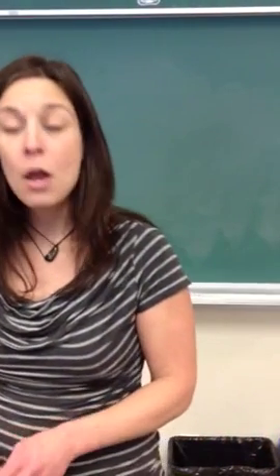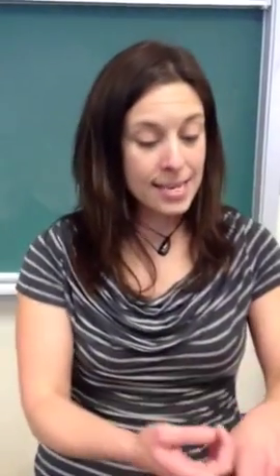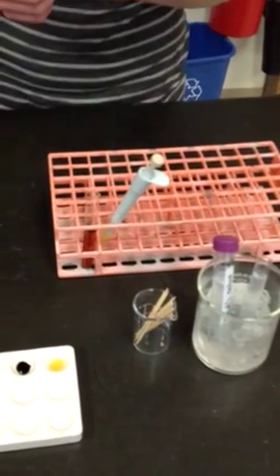Now, I will not put starch in there because if I did put starch, it would be blue, and that would not give me any information that I don't know already. We've already tested the starch, and the starch does indeed react with iodine. What I do have to put in there is our amylase solution that I have over here. Let me grab some clean tips for that.